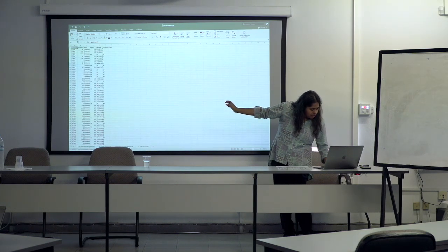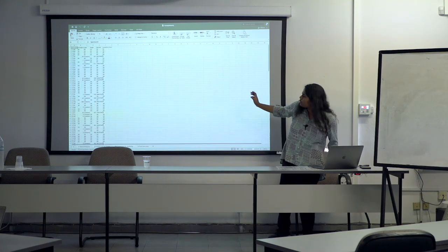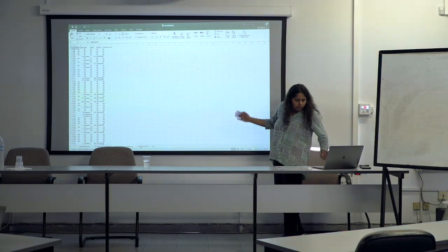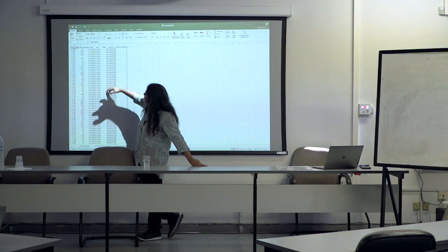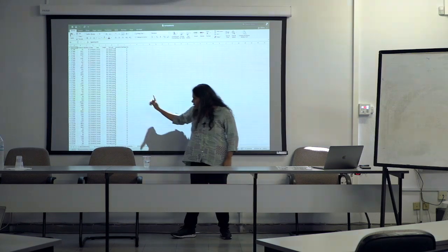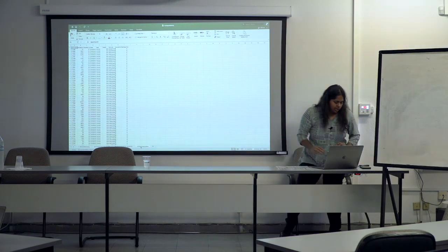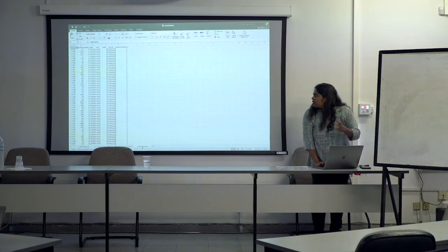You have demultiplexing, and then the barcodes that were called at the consensus by length stage. Then you have the consensus by similarity stage here. And what you probably want to use is the final compilation of all of that. You can sort your data in your Excel sheet based on coverage, ambiguities, whatever you want, and export that file.